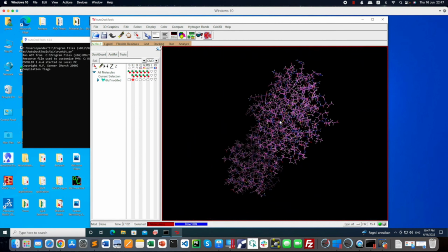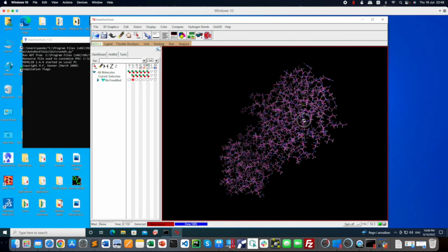But if you haven't used Chimera at all, there is another way that you can prepare your protein structure, and you can do a lot of structural modifications prior to the docking. Before that, I recommend everyone to open your protein and delete all the non-standard residues before doing some structural modification in MGL Tools. So I'm going to show you how to use MGL Tools for the protein preparation wizard.